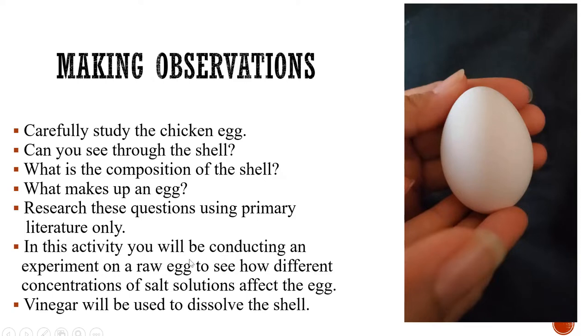In this activity, you will be conducting an experiment on a raw egg to see how different concentrations of salt solutions affect the egg. Vinegar will be used to dissolve the shell. Let's make our observations.